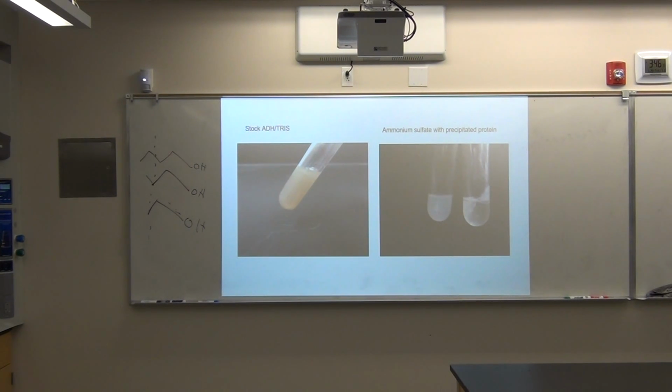One of the most interesting things that we found was that every day when we came back and these guys would make their stock ADH, it would turn brown again, and more brown and more thick. So they were like, damn, what are we gonna do? They had to centrifuge their stock ADH at least 3 times in order to remove the actual yeast that kept reproducing every day. And we were like, well, what is going on with that?